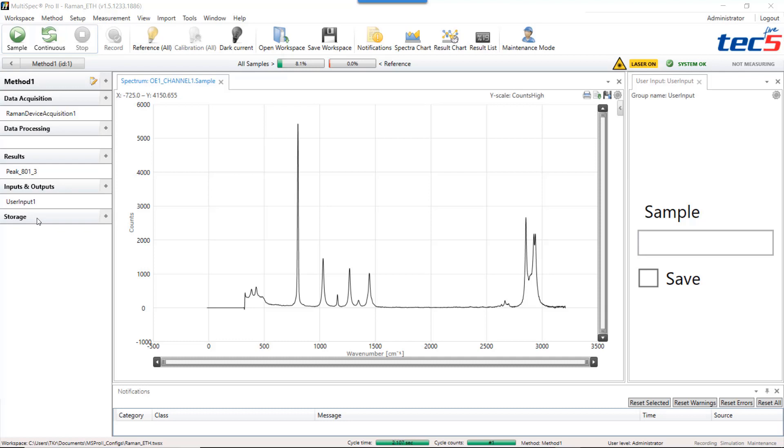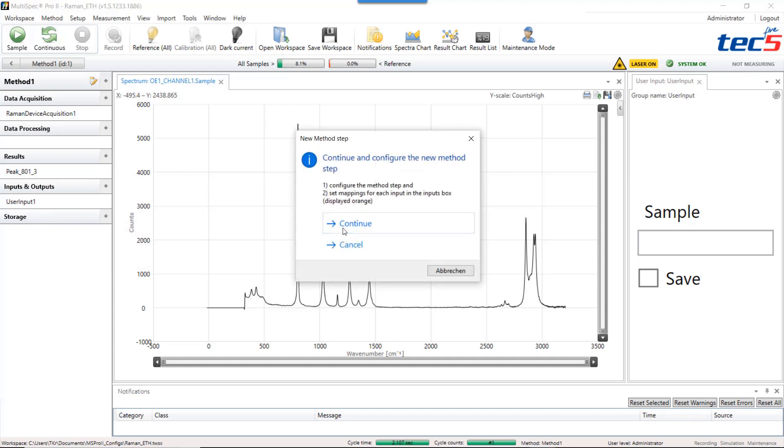In order to create a result storage you press plus and select save all results. You confirm with continue.